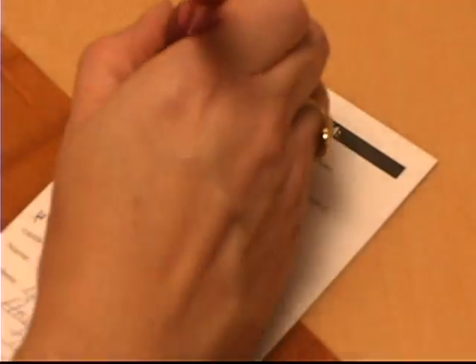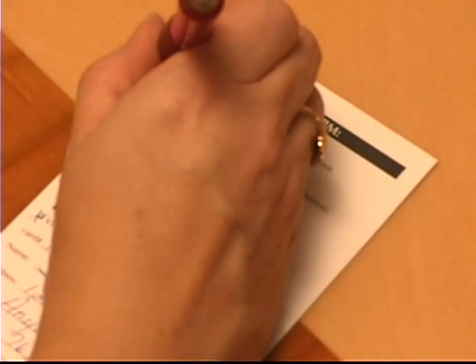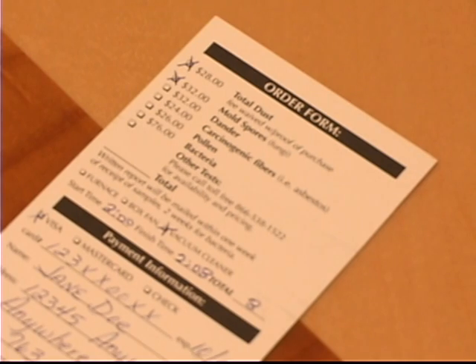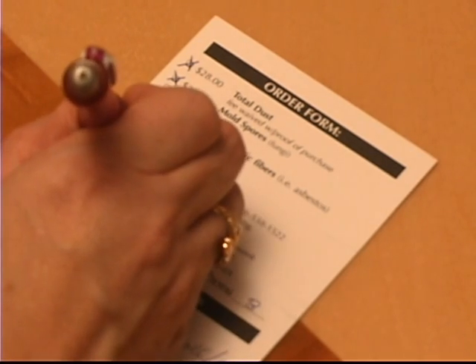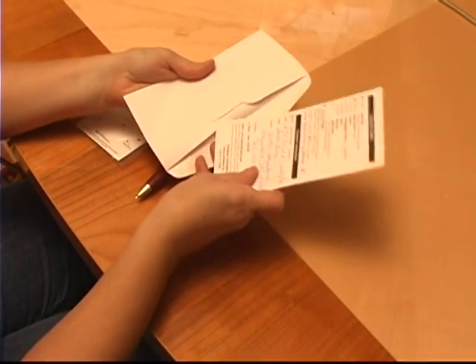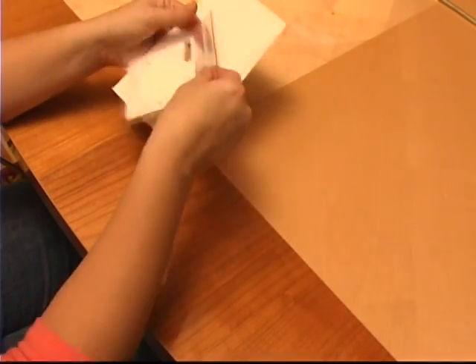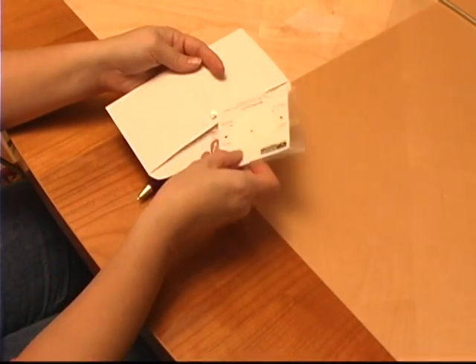Step 8. Complete the order form and select the test or tests you would like to have performed by marking the appropriate boxes. Step 9. Place the Jossam Sampler, order form, and payment in the enclosed prepaid envelope and mail to Tektron Engineering.